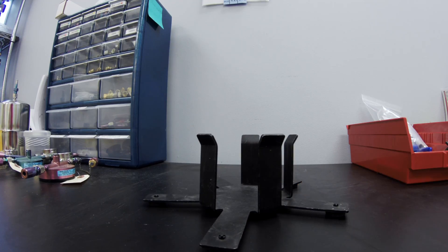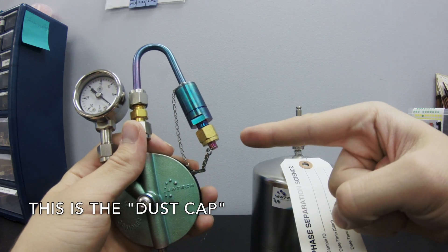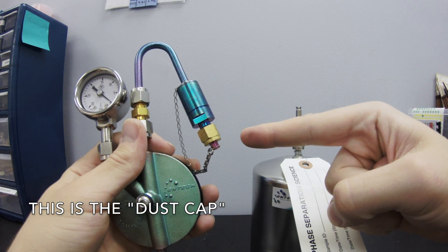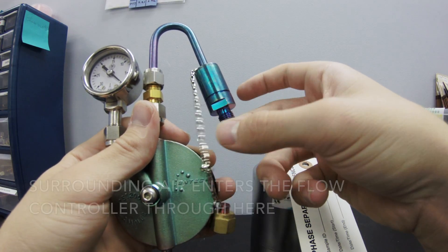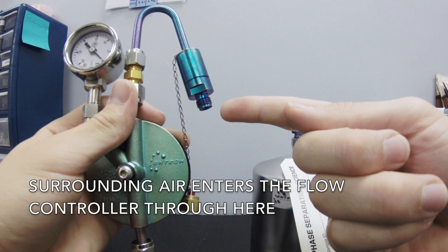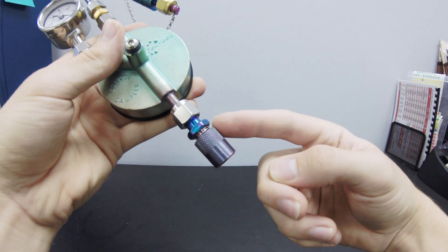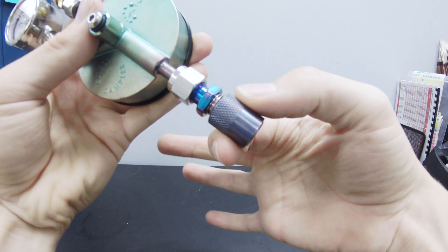When you are ready to sample, place the can into the stand. You will notice that the flow controller has a dust cap covering the inlet. It must be unscrewed to allow surrounding air to enter the flow controller. This piece is the locking mechanism — it allows the flow controller to be locked onto the canister during sampling.